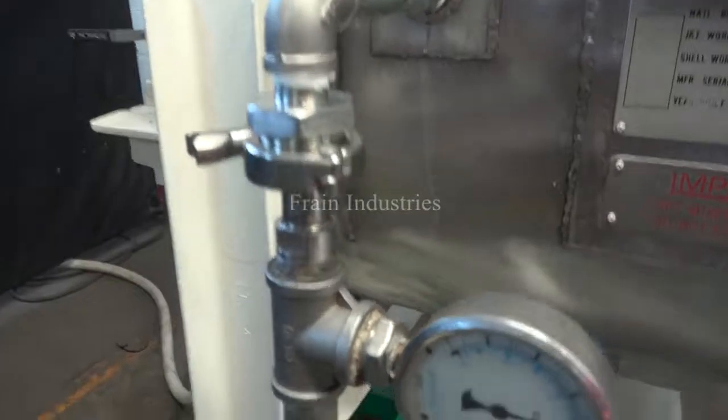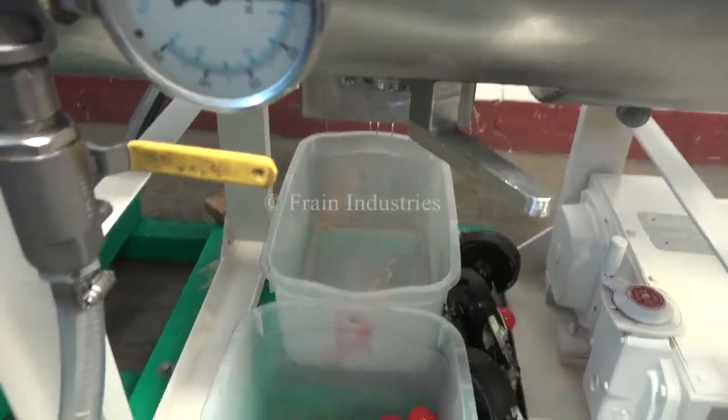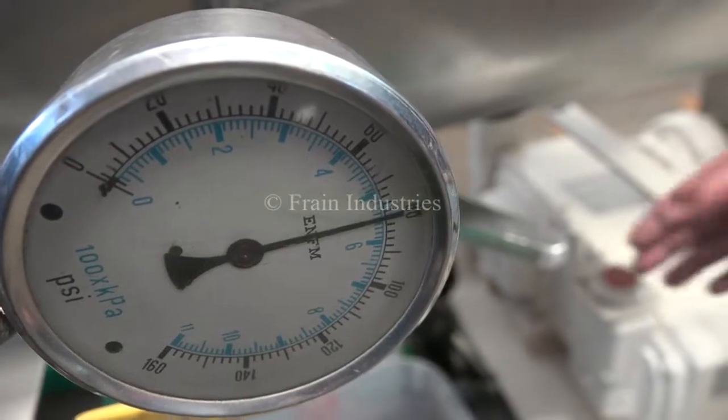I'll now open the discharge chute. We pressure tested the jacket and it's currently holding at 80 PSI.